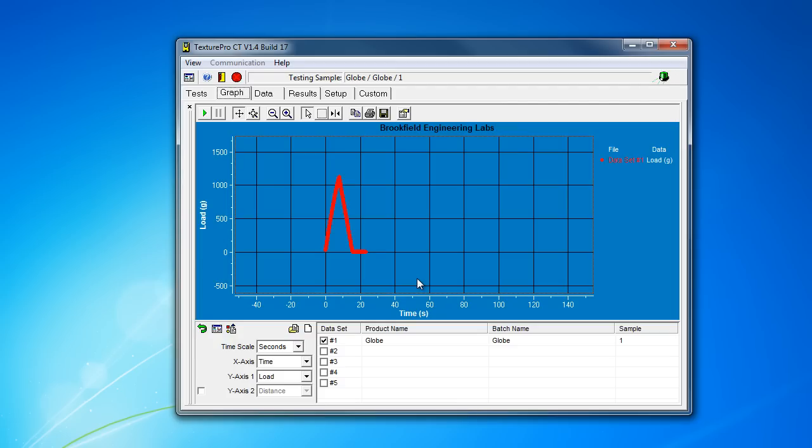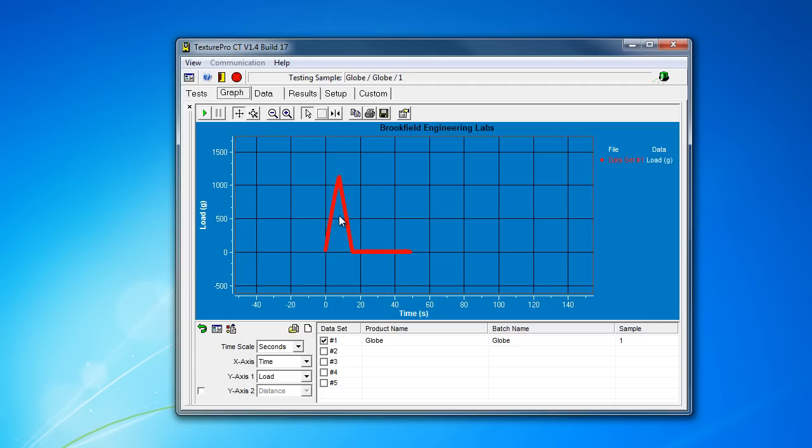What we've got here is our basic compression graph of my little cube or my globe over here. I'm just going to do a little bit of analyzing it and show you how the software manages how you view data, how you look at the data. The general options you have are pretty primitive. It will record the data points at 100 per millimeter, but the actual ability to manage it, export it, save it, view it, do calculations on it is really, really restricted.